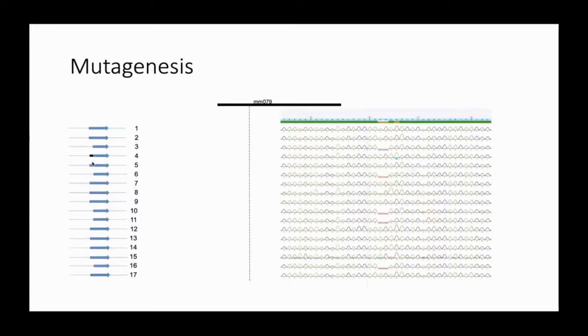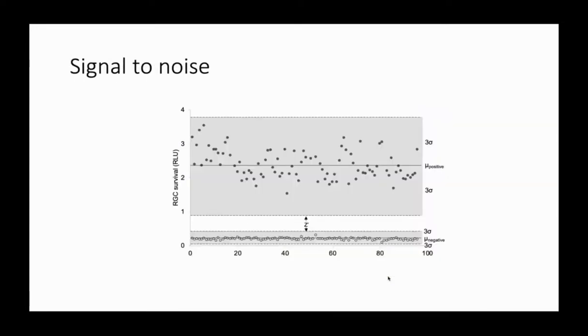If we put in a single gRNA, we saw the typical cutting, where the mutagenesis is typically small deletions centered around the 3rd and 4th nucleotide just upstream of the PAM sequence. Using this technique, we were able to produce mutagenesis in approximately 50% of the population of primary retinal ganglion cells.